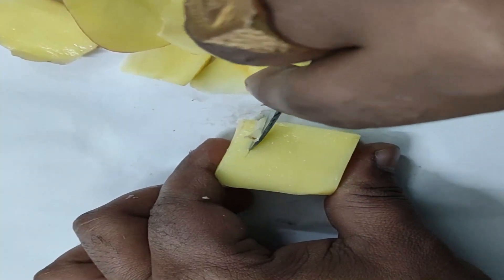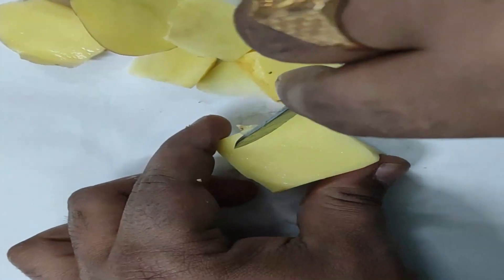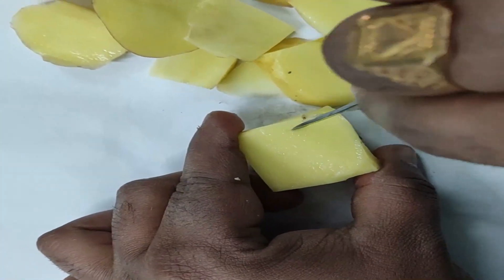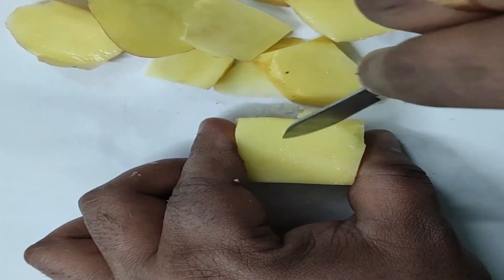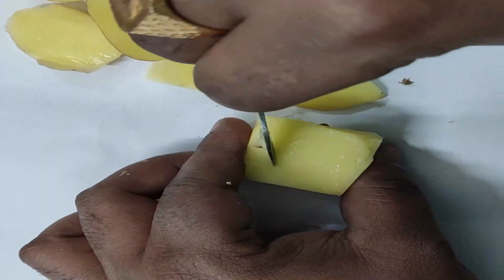Now we will make the inside hollow. We should keep in mind there should not be any leakage between the walls of the potato cube. After making this cavity inside the potato, our potato cube is ready for the experiment.